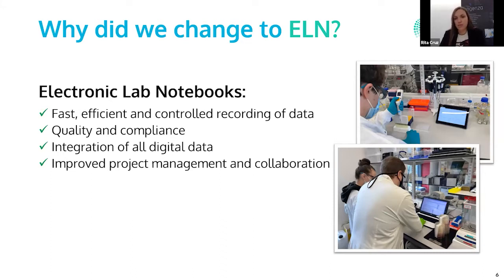So here are some photos of colleagues of mine. So at Ingenza, we use SciNote on the lab bench directly, either through tablets. Here, in all honesty, we mostly use the tablet for consulting a protocol or checking some data, not really to input data live, because it's not really straightforward or easy to type on a tablet as it is on a laptop.